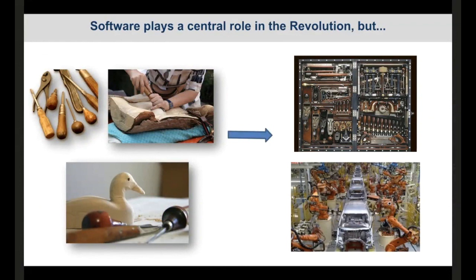In the early days of Cryo-EM, it was more like handmade processing, right? It was just a small bunch of tools, and very few labs developed software. The users were either the developers or were very close to the developers. And then you needed to be very expert in the field, very skillful, to get a reconstruction.